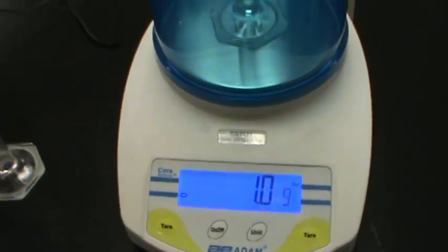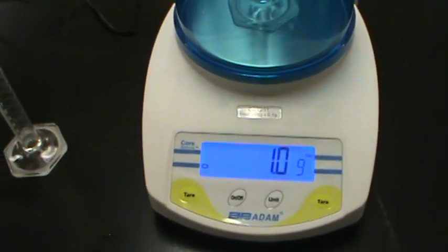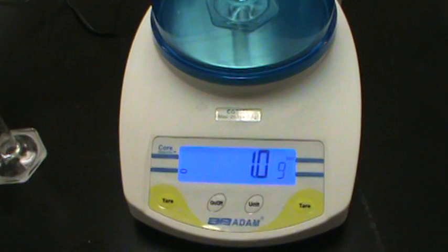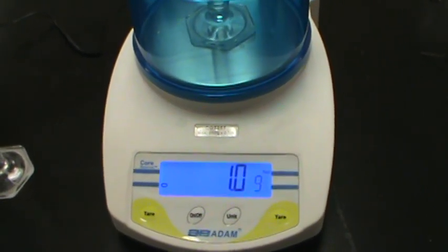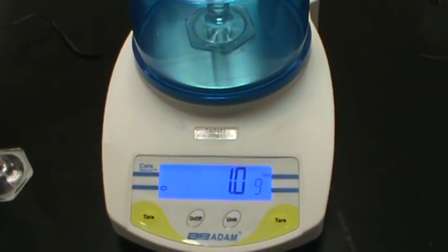So once again proving that one milliliter of water weighs one gram. Amazing, that metric system. Thank you.